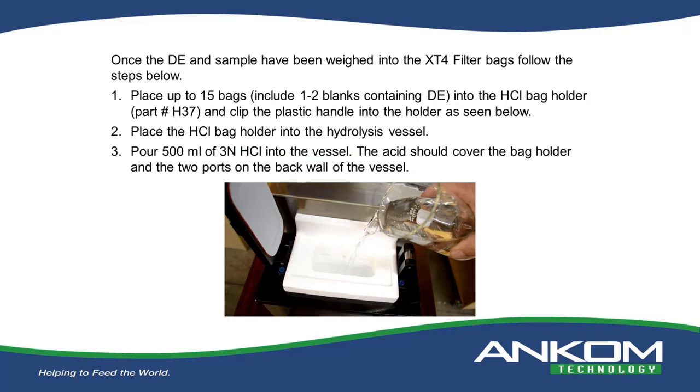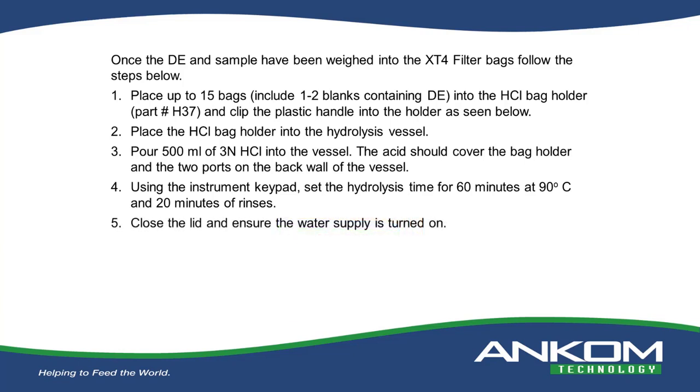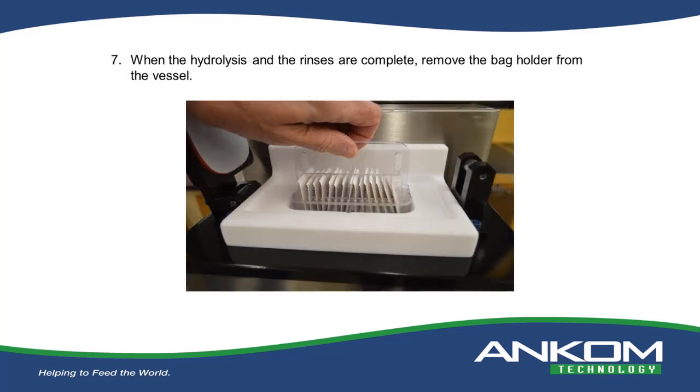The acid, again as we talked about before, should cover not only the bag holder, but the 2 ports on the back wall of the vessel. Using the instrument keypad, set the hydrolysis time for 60 minutes at 90 degrees C and 20 minutes of rinses. Close the lid to ensure that the water supply is on. Finally, press Start. When the hydrolysis and rinses are complete, and the time frame will be about an hour and 20 minutes, remove the bag holder from the vessel.